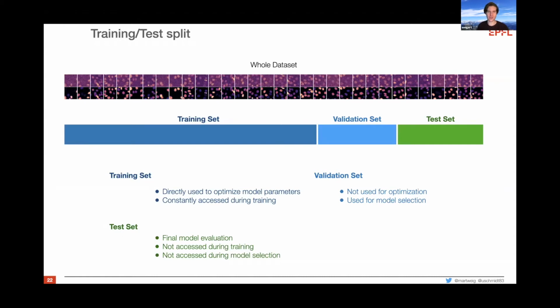So it's concentrating very heavily on the intricacies and textures of your training set, but it's not focusing on the things that would generalize to unseen data. You always want to avoid overfitting, and the validation set is there to check for that. We will see later in the notebooks that this is a common split to do at the beginning. So you always want to split your data set into these three subsets.